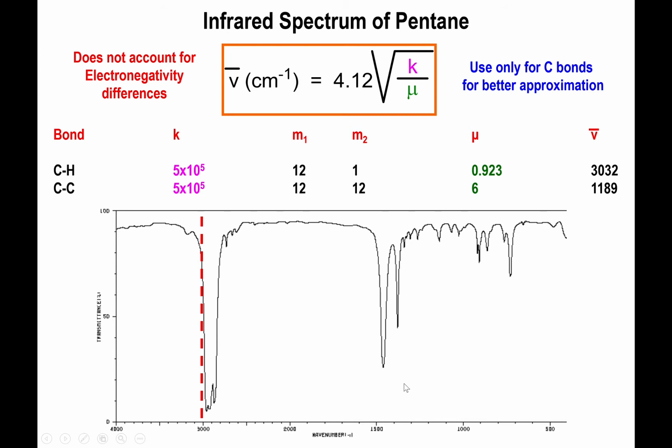And the reason why is because this is set up as if you were doing your typical UV spectrum that is based on wavelength, right? So the wavelength and energy are inversely related, right? So this has the lowest wavelength, this has the highest wavelength. So it's technically addressed in terms of wavelength absorption, but we are expressing all of the values in terms of inverse centimeters, which is the wave number. I don't know if this was really necessary to do it this way, but this is the way that's been done for a long time and continues to be done, so we're going to stick with it.